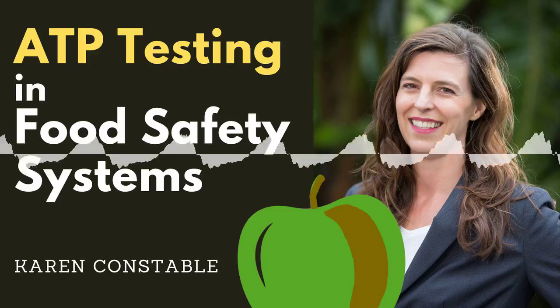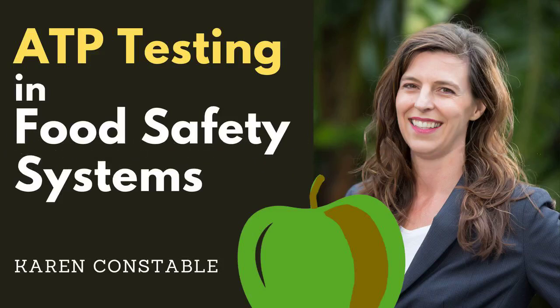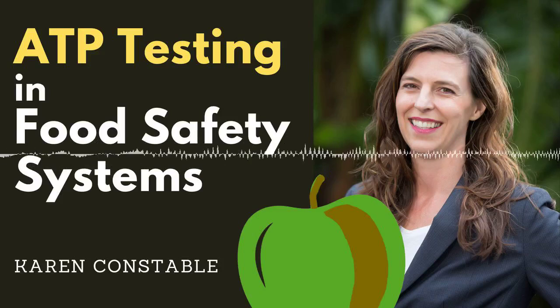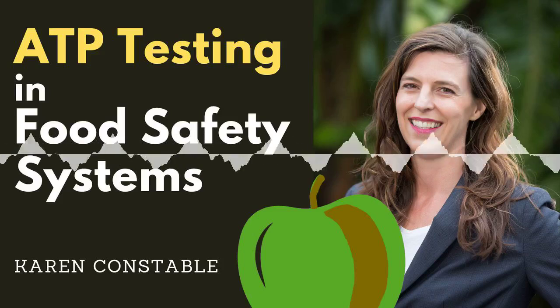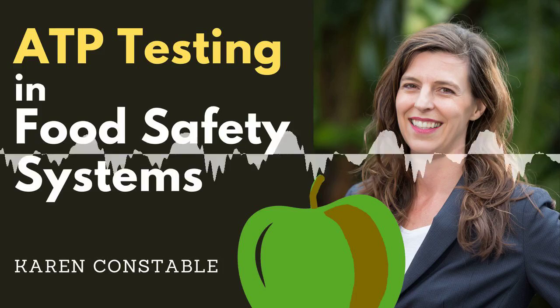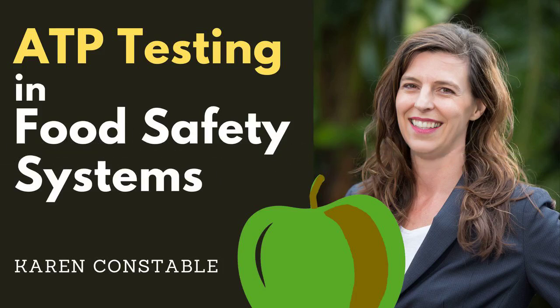ATP testing in food safety systems, an introduction or a reminder. ATP testing is a technology used for measuring the cleanliness of surfaces in food handling environments. ATP test systems can detect traces of the chemical ATP on the surface being tested. ATP is adenosine triphosphate, a molecule found in all living cells. It's also present in materials that were once living, including food.